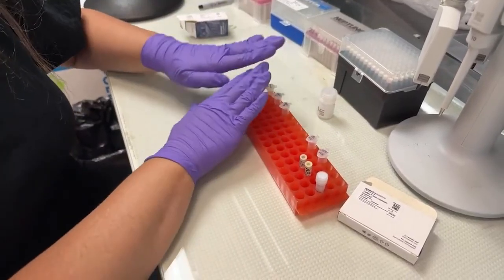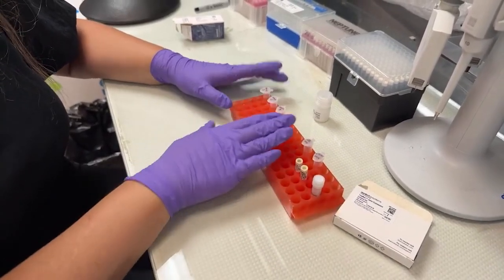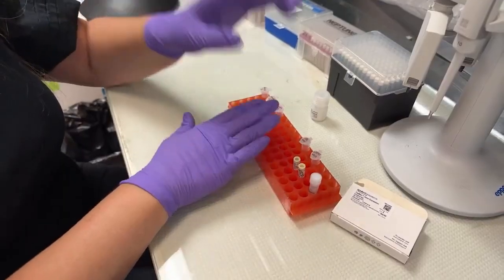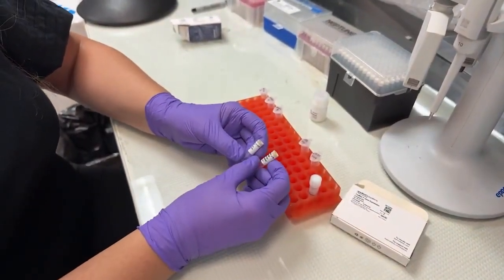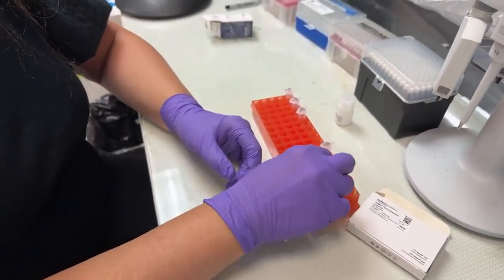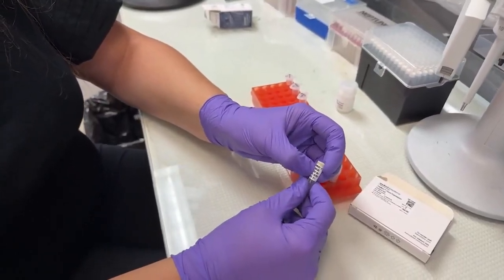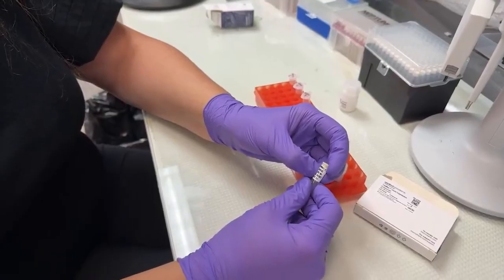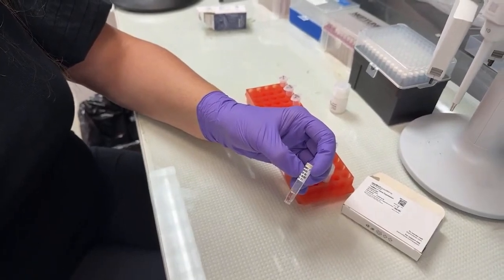So I have 3 samples prepared from our original stock solution, and we're going to have a 4th no template control. I'm going to go ahead and make each of these, double checking that the assay matches what I have listed on my tube. This is provided at a 20x concentration, meaning for each individual 10 microliter reaction, we're going to use 0.5 microliters of this material.